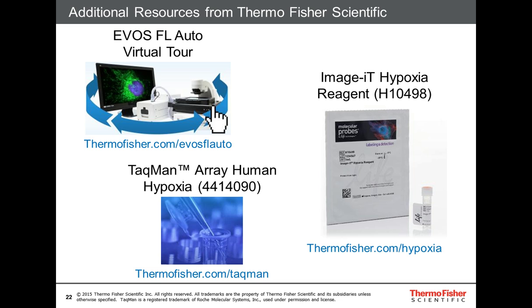I have problems seeing HIFs on a Western blot. Might it be due to the fact that extracts are prepared in the presence of oxygen? Yeah, I guess that's a fair question. And it goes back to this idea that if you really want to control oxygen across the time course of your entire experiment, then everything needs to be done in a controlled environment, because oxygen can equilibrate quite rapidly. Even if you have a cell culture incubator with a controlled oxygen concentration, the act of opening the door, taking the plate out, moving it to the lab bench to change the media or harvest the cells, you're no longer at the same concentration of oxygen that you were in the incubator.